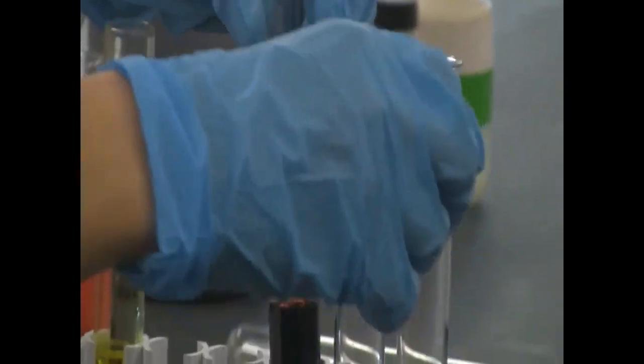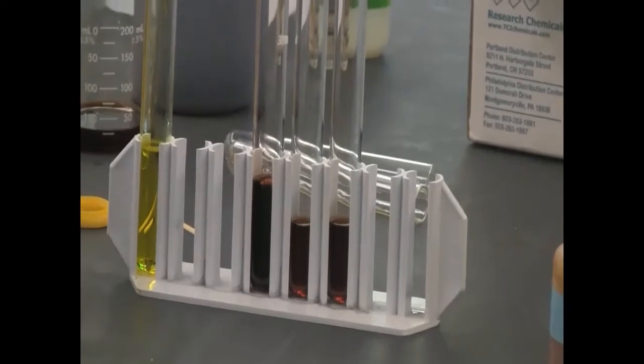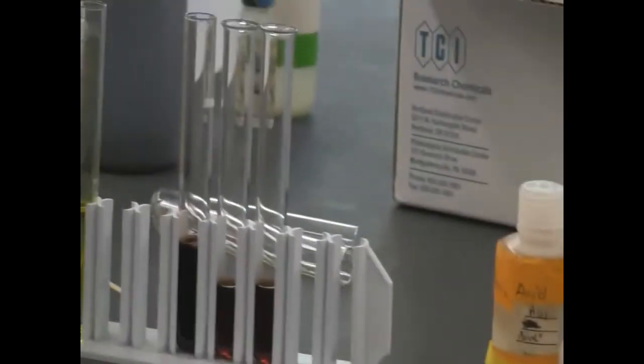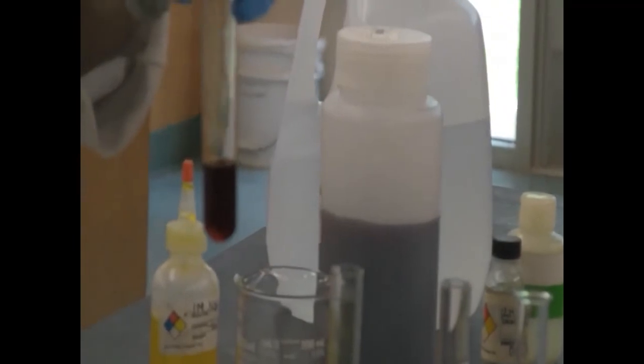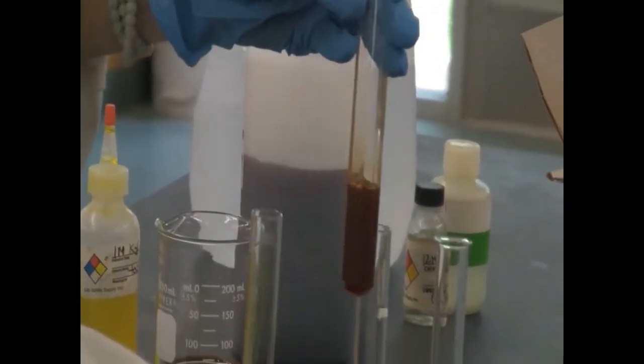Alright, so number 2 test tube, we need to add 20 drops of the iron chloride. Okay, so I'm going to add this iron chloride. Control.